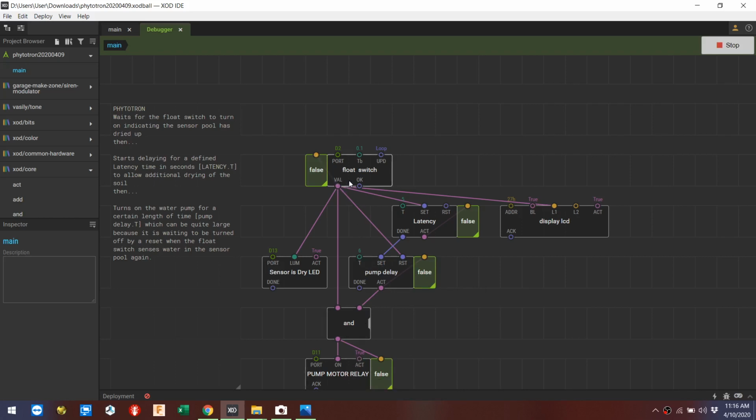Now what I'm going to do is turn it on and just let it go for the full time, this 6 seconds. See, that's true. And then this is going to be true for 6 seconds. And then we're just going to watch down here, it turning false. False after 6 seconds. And then finally I'm going to demonstrate by doing this true, and then I'm going to have it turn off. Right now I let go, and that went false.